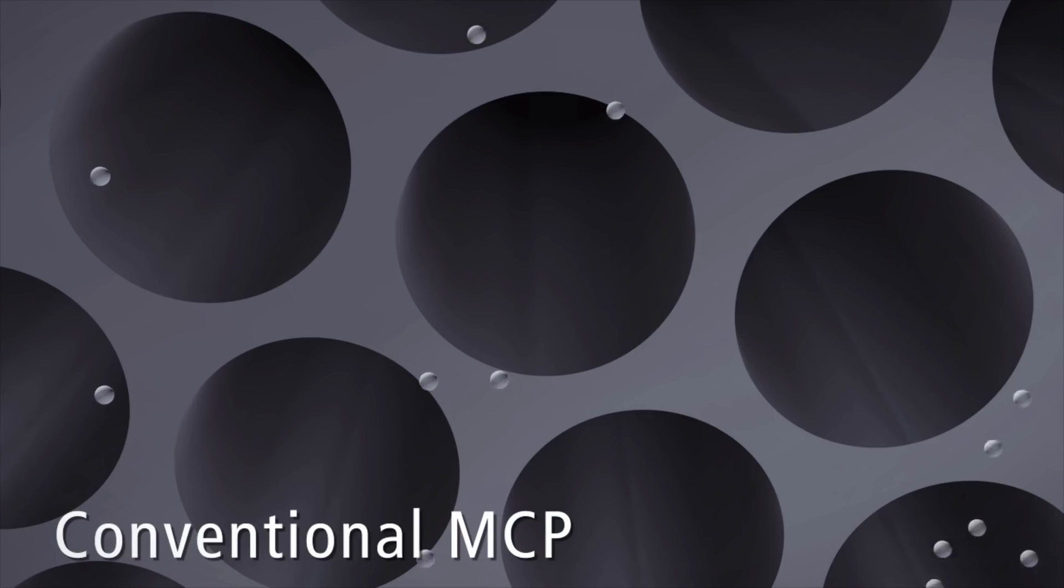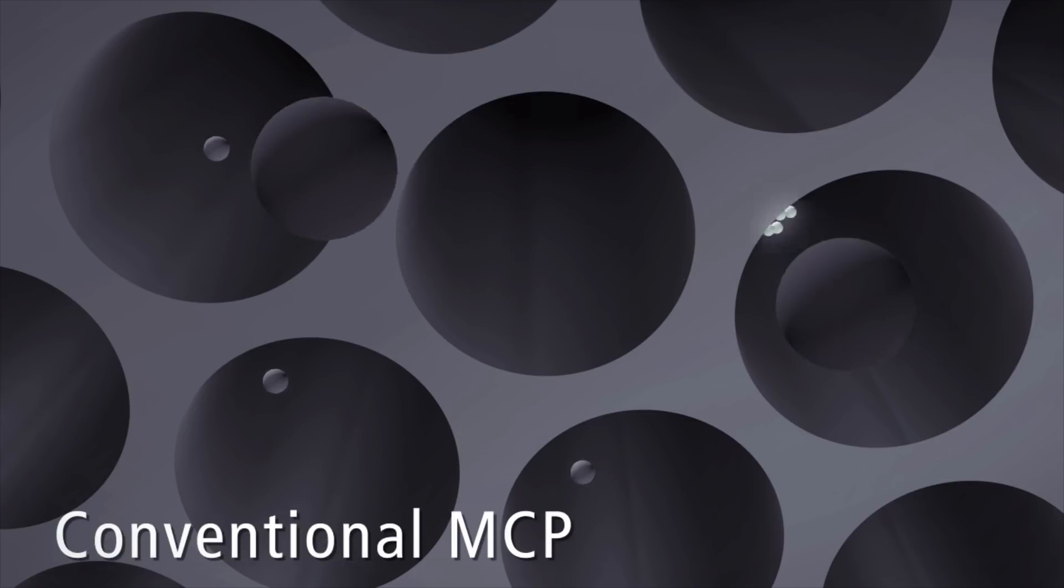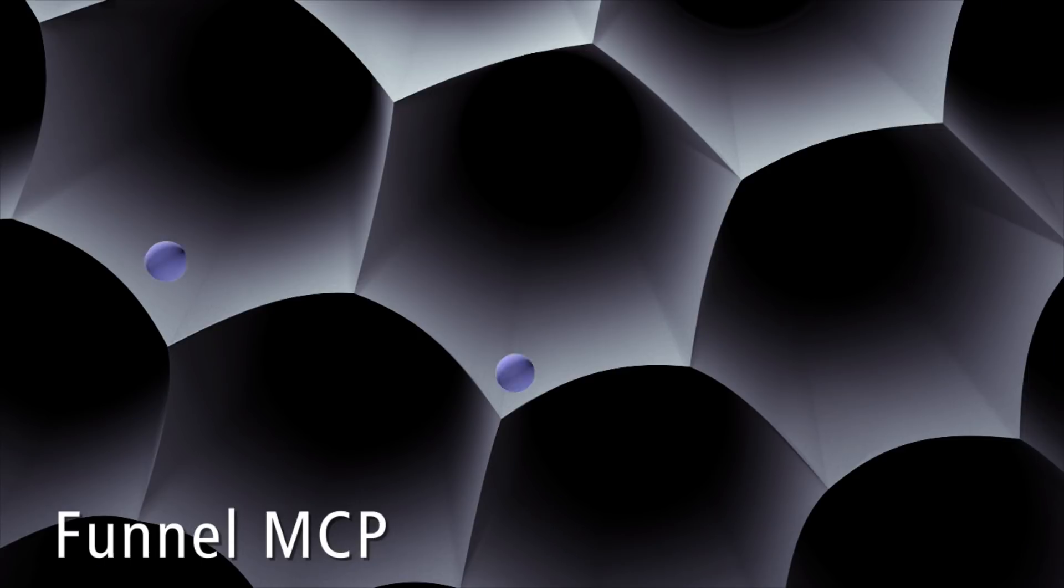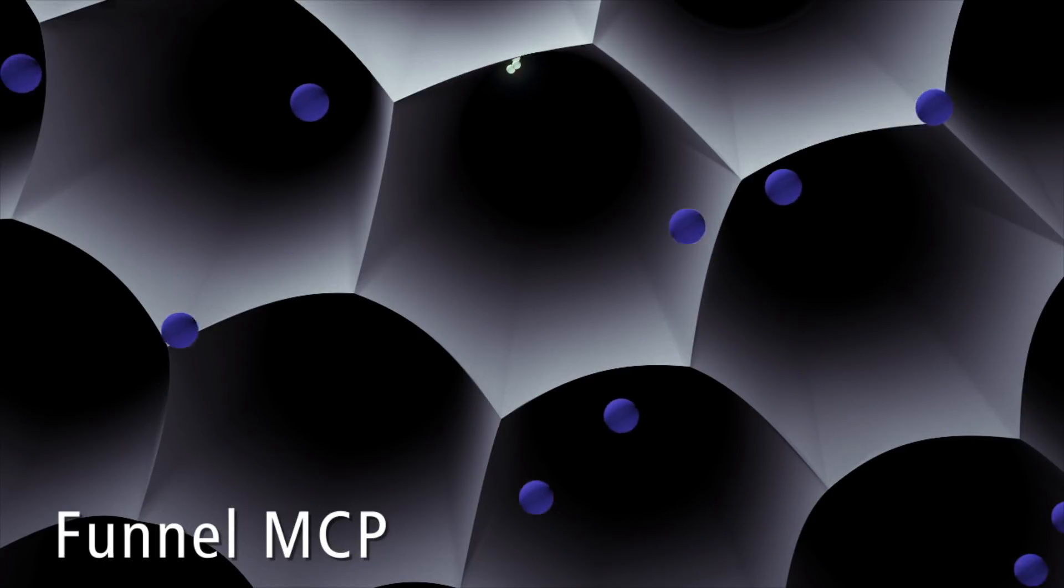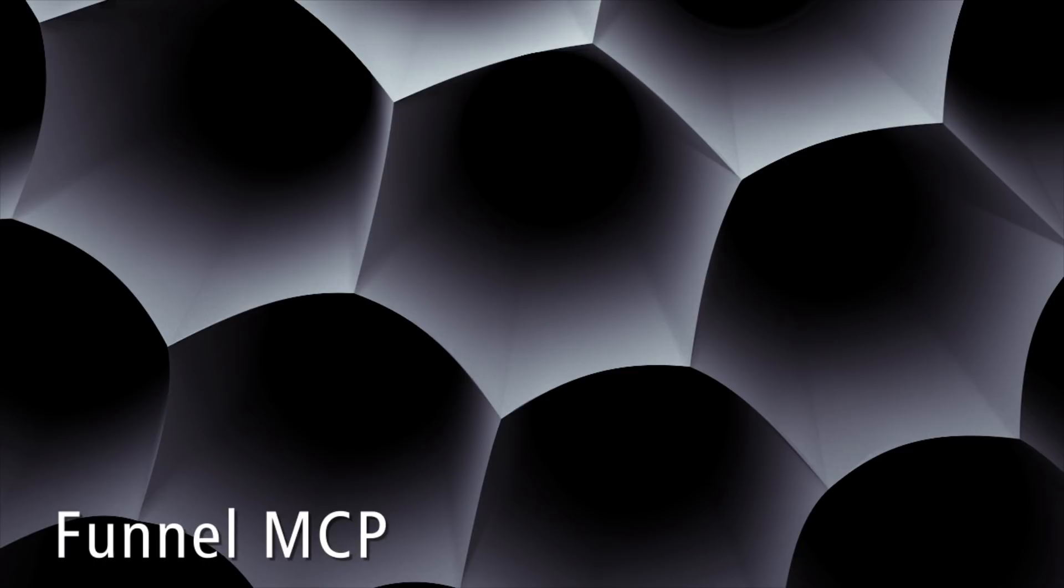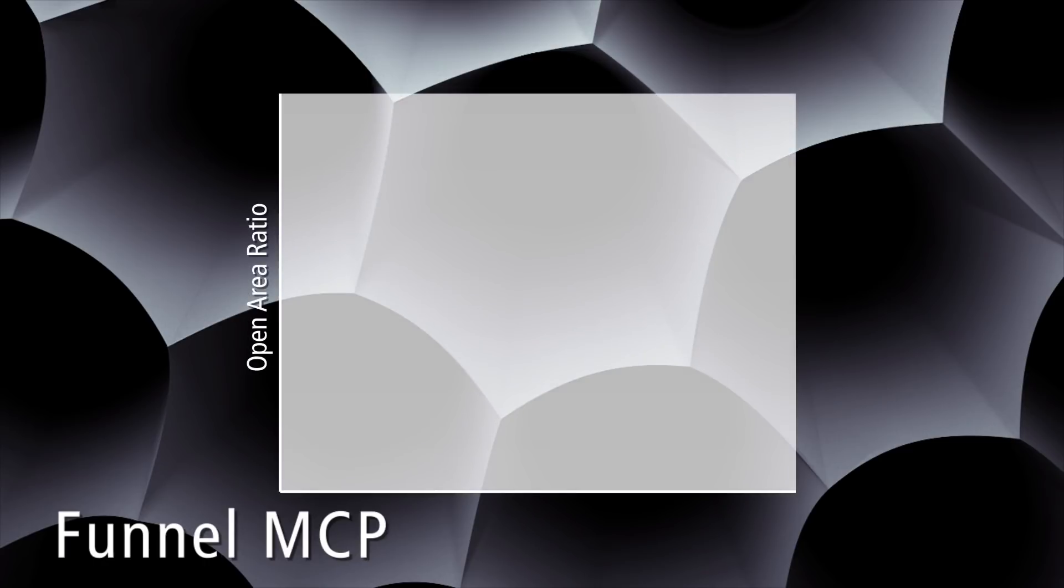While conventional micro channel plates can only detect ions on 60% of their surface, the newly designed Funnel MCP makes full use of its surface, effortlessly increasing sensitivity.